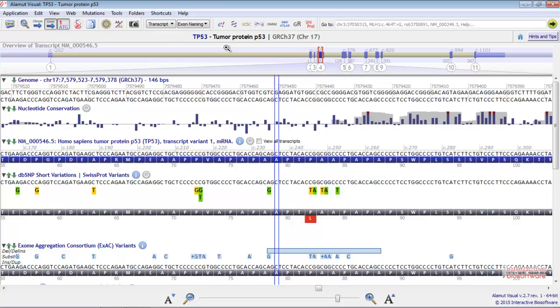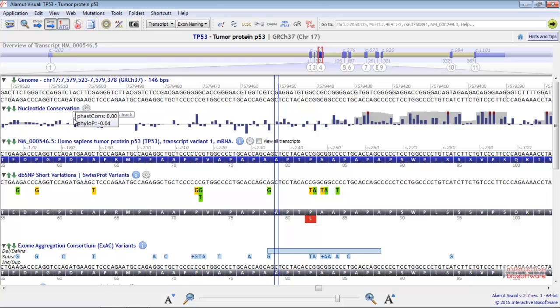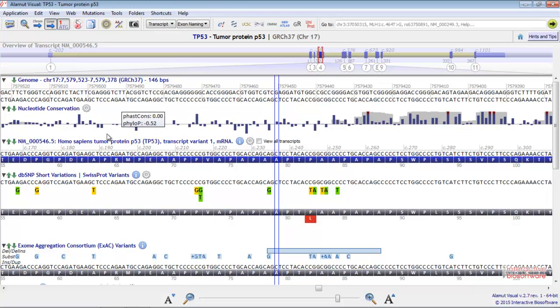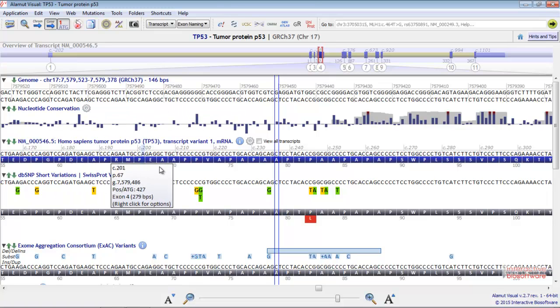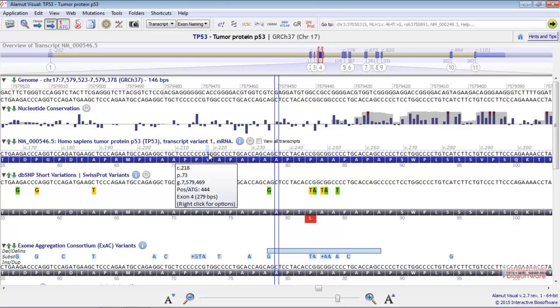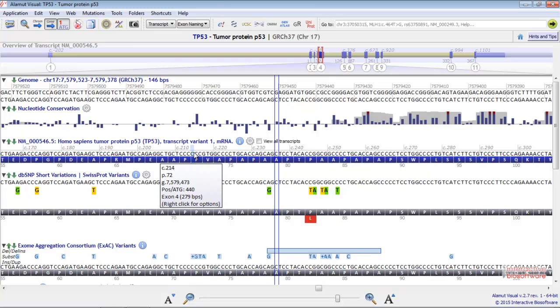Here you have an overview of the transcript. Here you have the genome sequence, the nucleotide conservation track, and here we have the mRNA track where we can create some mutations.